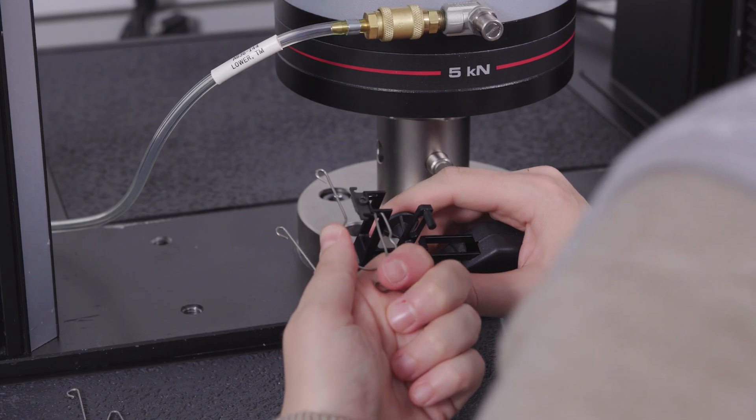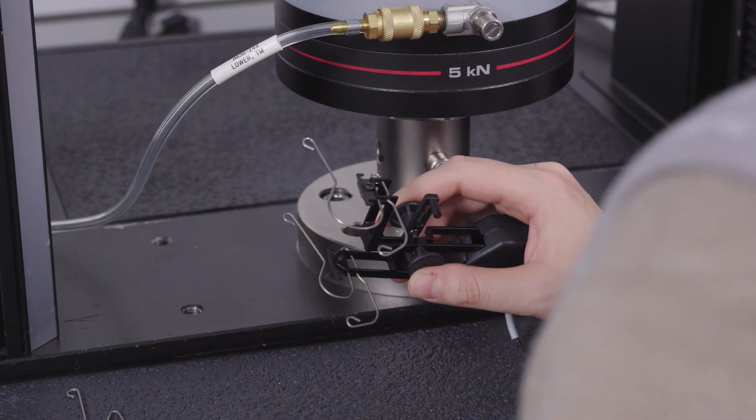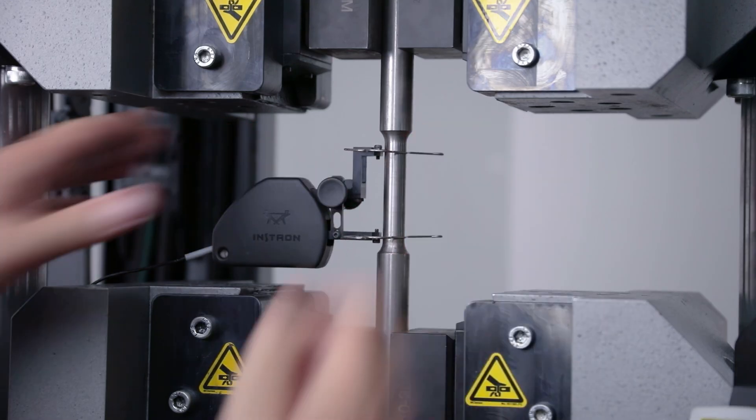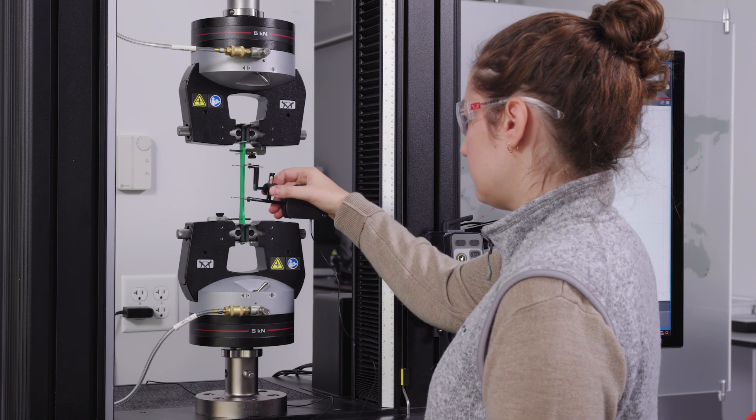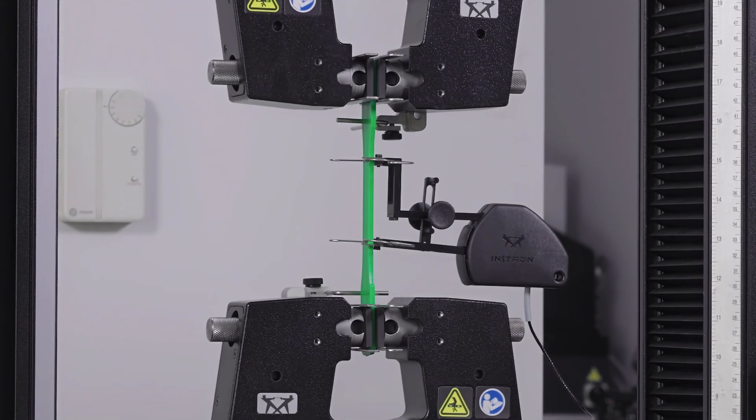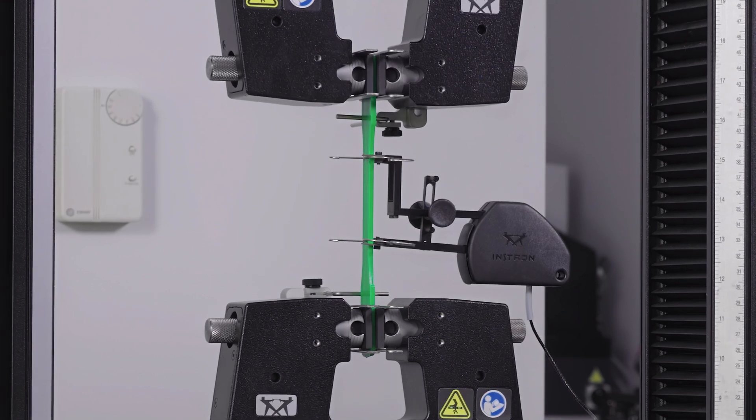The interchangeable rapid attachment spring clips make it easy to attach the extensometer to a variety of specimen geometries and sizes, while the low operating force arms reduce the possibility of knife-edge slippage when testing hard or smooth surface materials.